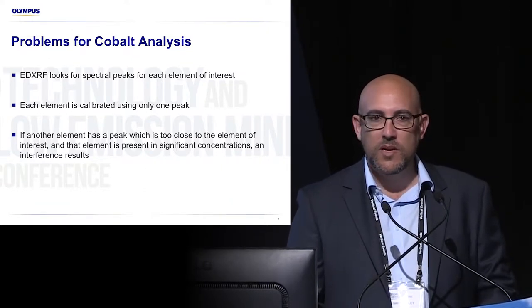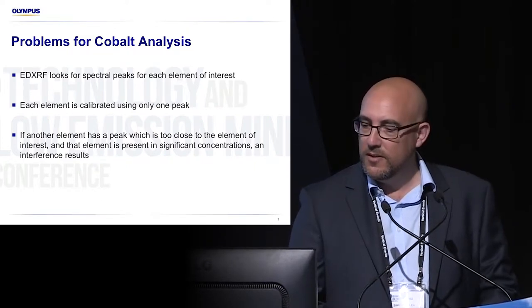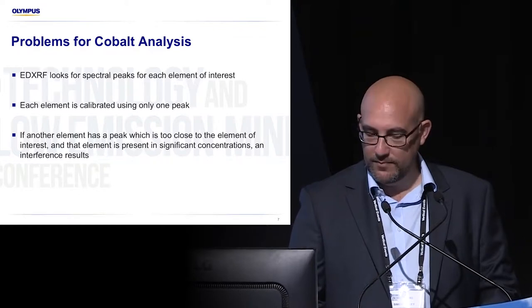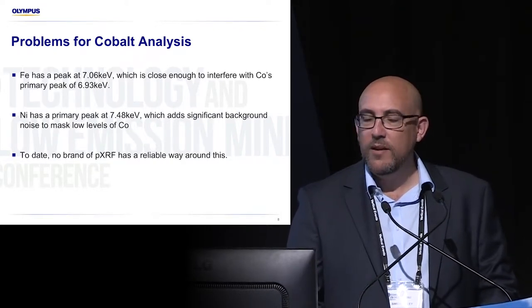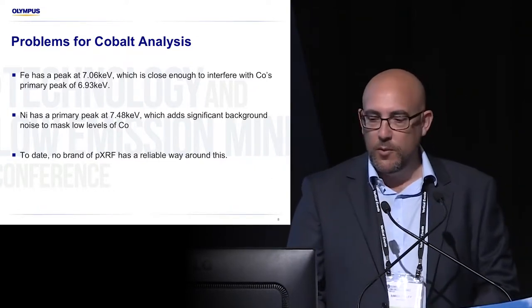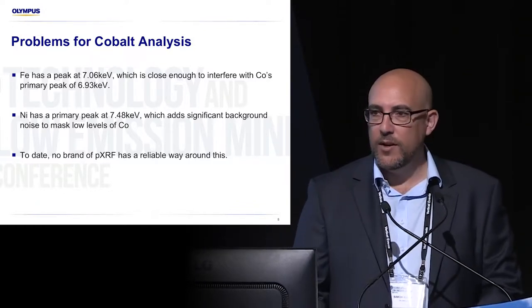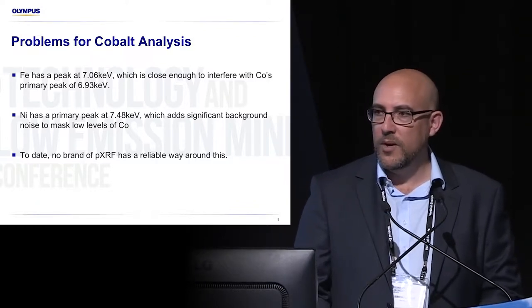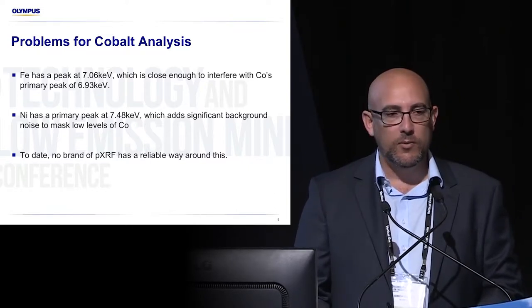Gold has issues with tungsten, lead, arsenic, zinc, selenium — the list goes on. The big issue is iron has a large peak at 7.06 keV, which is close enough to interfere with cobalt's primary peak, which is the peak we'd like to use for cobalt. If we can't use that peak, we have to use the second peak for cobalt, and our ability to see cobalt at lower levels is diminished.